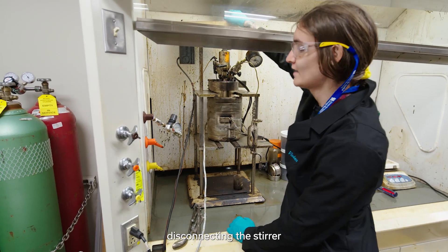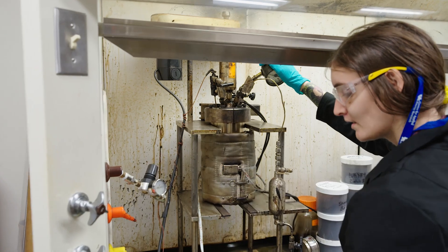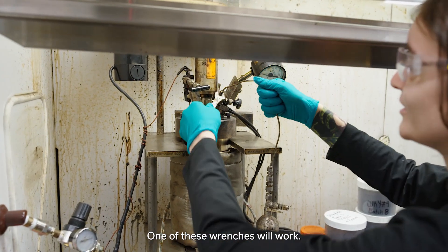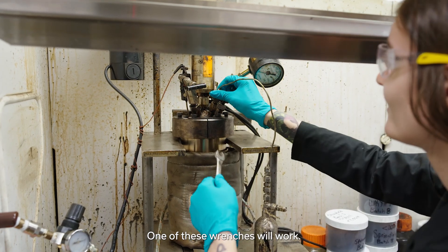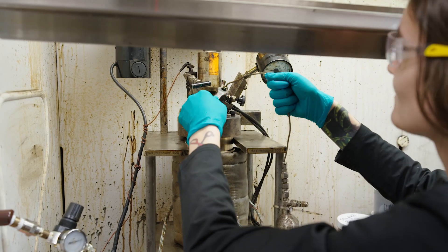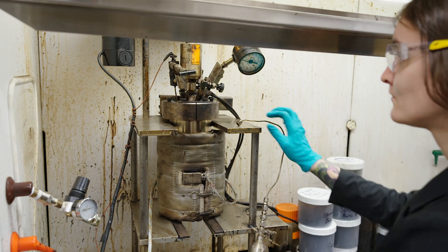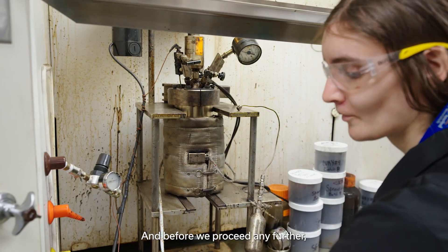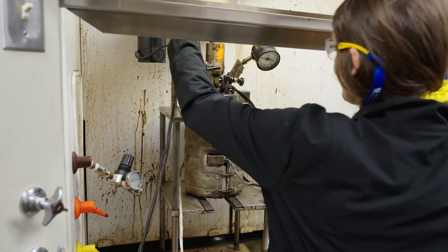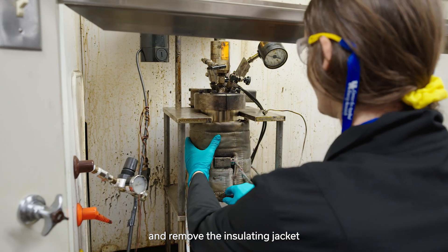We're going to start with disconnecting the stirrer and disconnecting our gas trap. One of these wrenches will work. Before we proceed any further, we're going to unplug it for safety.